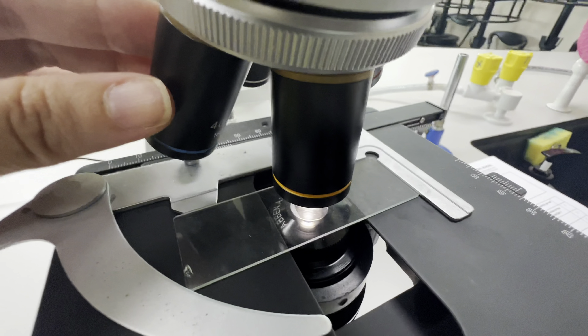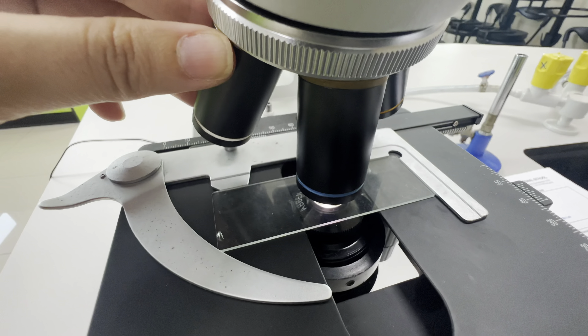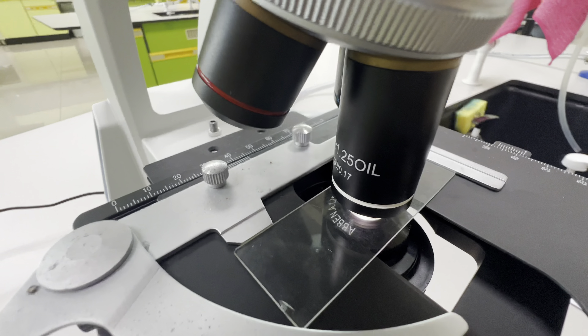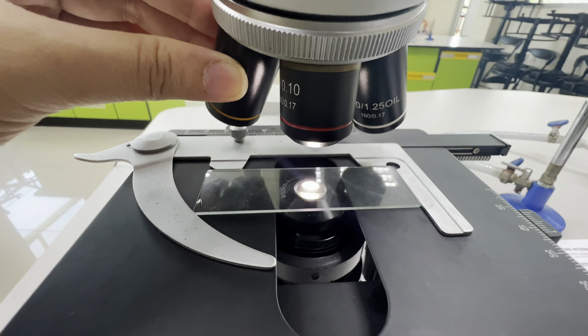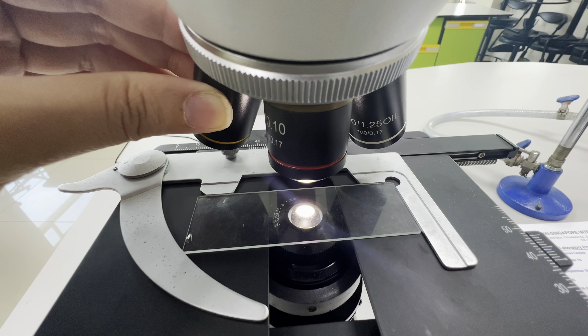The yellow is the low power objective with 10 times magnification. The blue is the high power objective with 40 times magnification. And the white is the oil immersion objective with 100 times magnification.